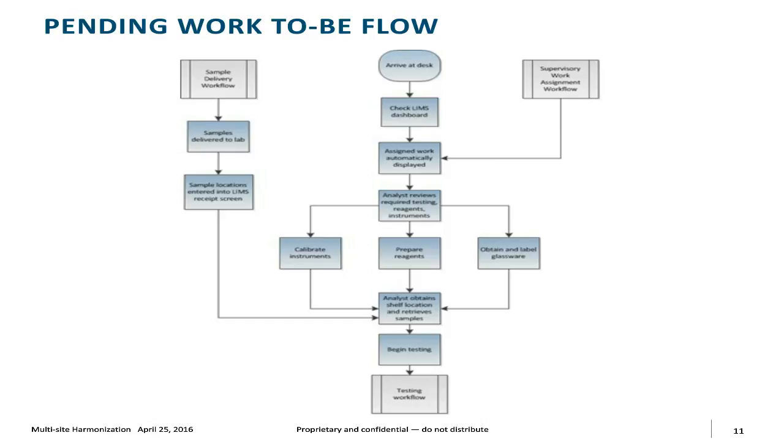If you think about it, if things actually are automated to the extent that samples are logged into the system, or maybe some sort of lots have been triggered in the LIMS system the night before, there are a lot of things that we do when we have dead time in our normal laboratory day. If I know that work is coming tomorrow morning, and I can't do the work till tomorrow morning, but maybe I have samples running on auto samplers and things like that, maybe I can start to get that glassware prepared the night before. Maybe I can generate barcode labels for glassware to be collecting samples and so forth. Maybe I can mix up some reagents or mobile phases I'll be needing for the next day. So we look at all those kinds of things as things that we can improve productivity in.